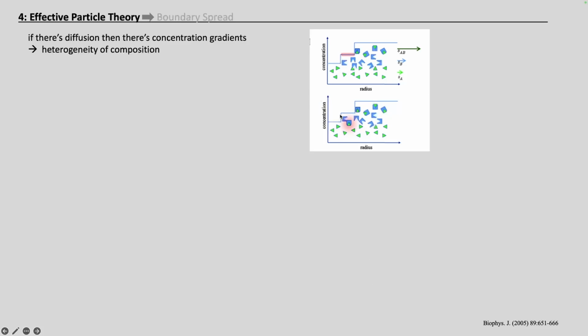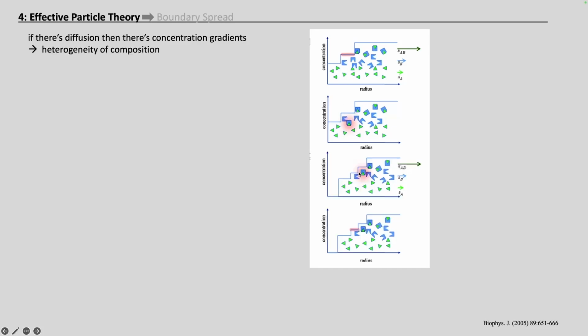You observe the concentration and composition in this region is lower, and when it re-equilibrates, it'll again have to form some complex, although probably a little less than original. Now freeze the reaction and let sedimentation resume. The newly formed complex will again sediment, and once again it lowers the concentration and alters the composition behind.